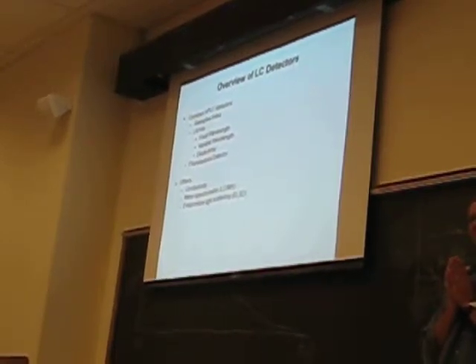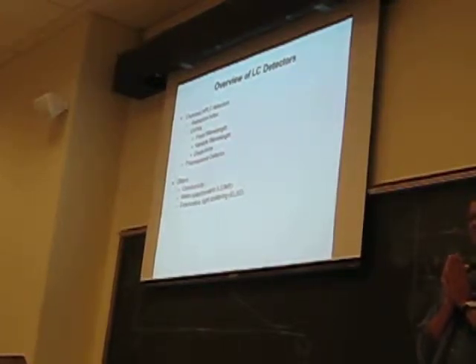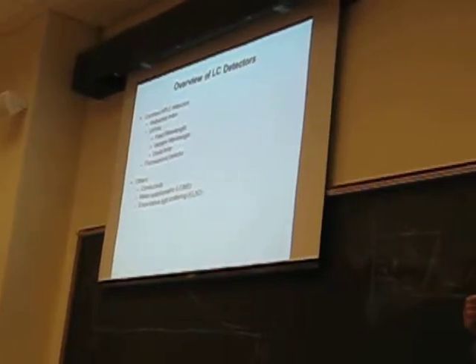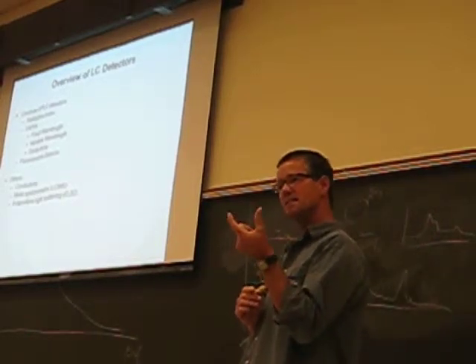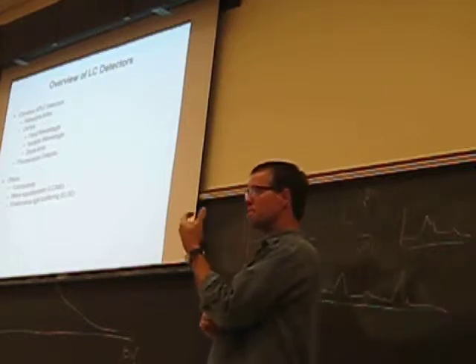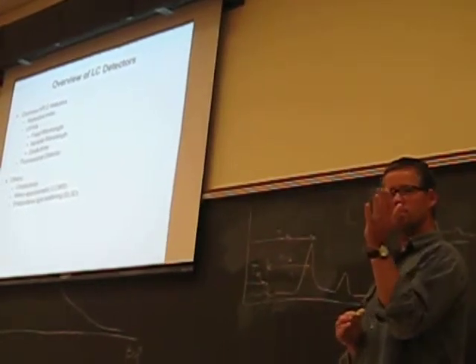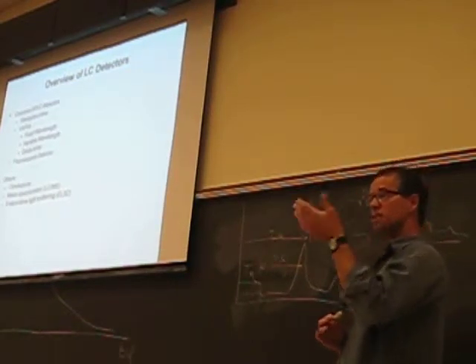Okay. I forget what it's called, but it's for AC, that's true. So you have a conductivity detector, right? And if it's a conductivity detector, I would infer that it's measuring conductance, right? And I did make the point of saying that conductance is determined, in an alternating current circuit, by impedance. But what you're actually measuring is conductance. So your signal, in, is it micro-Siemens? I can't remember. That is a measure of conductance, right?